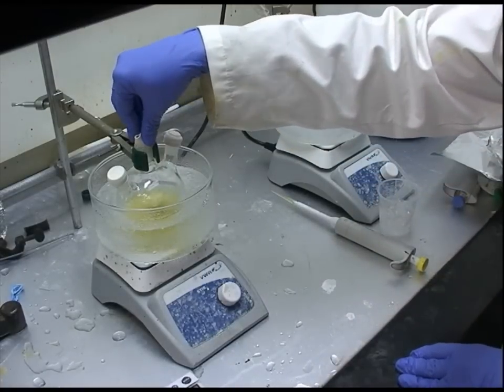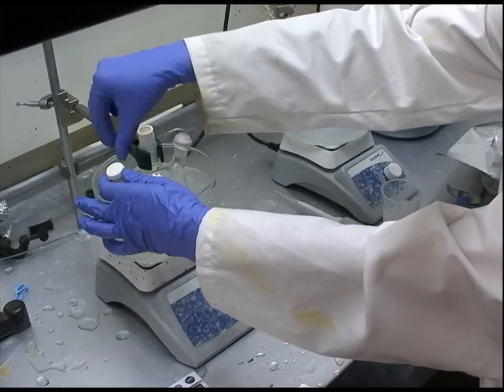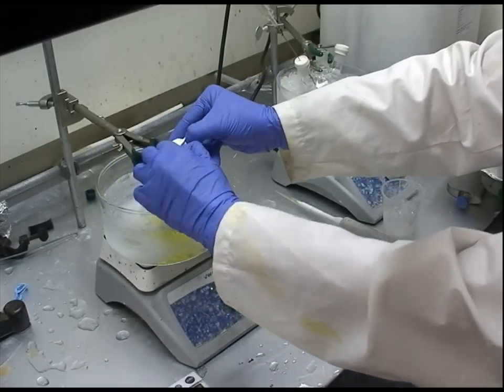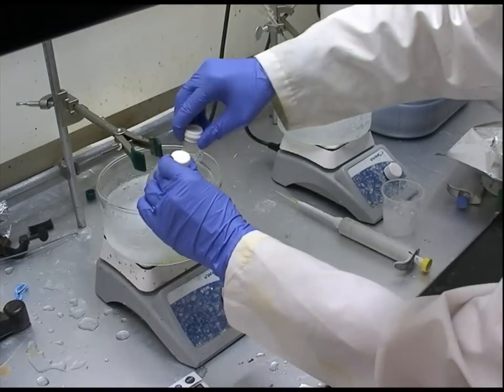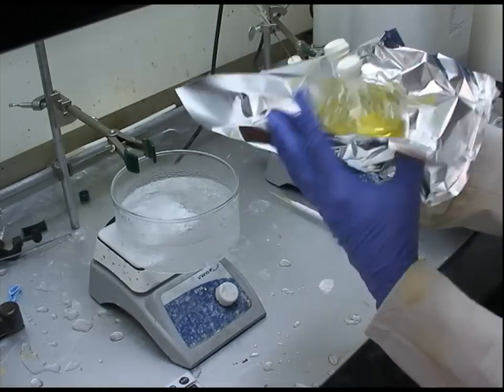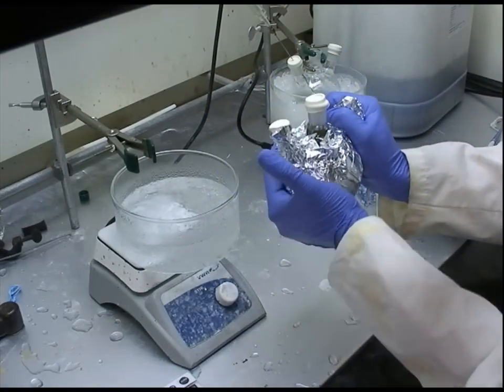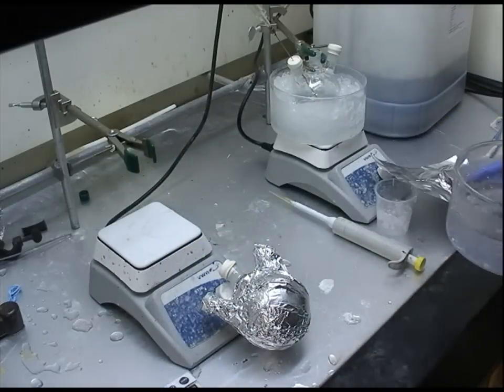After adding the last of the BSPP and sodium borohydride, we let the solution age for about 15 hours. We stopper the solution completely and wrap it in tin foil so that it will be completely in the dark during aging. We also replace the ice so that it will remain cold for the duration.